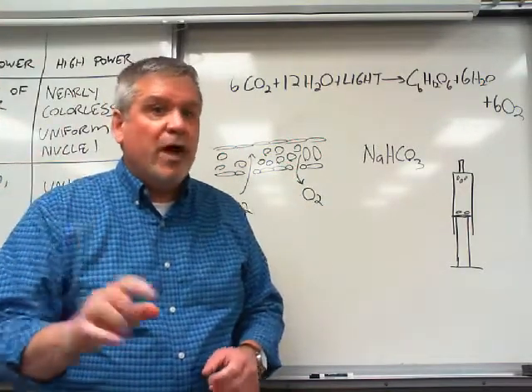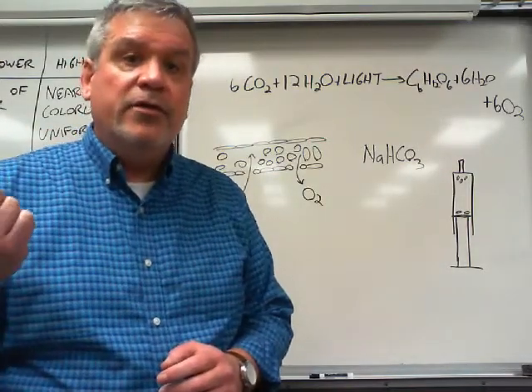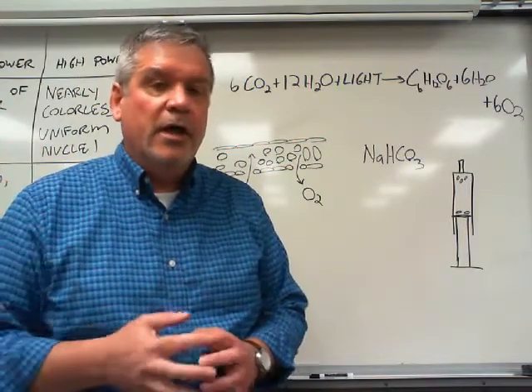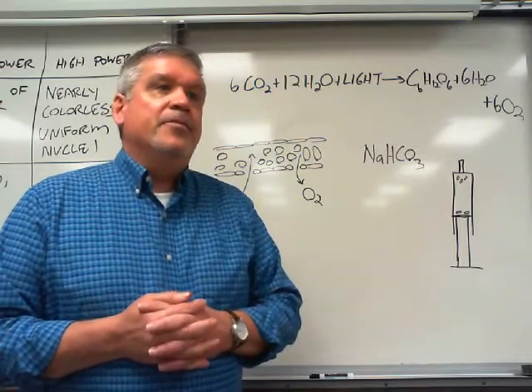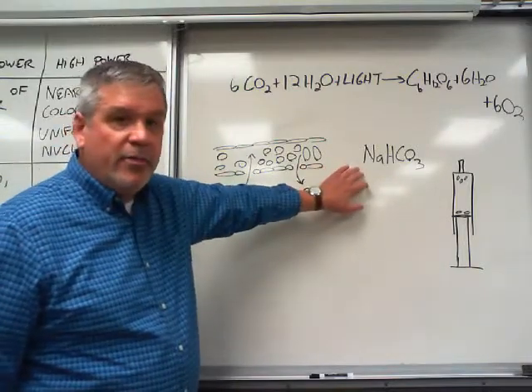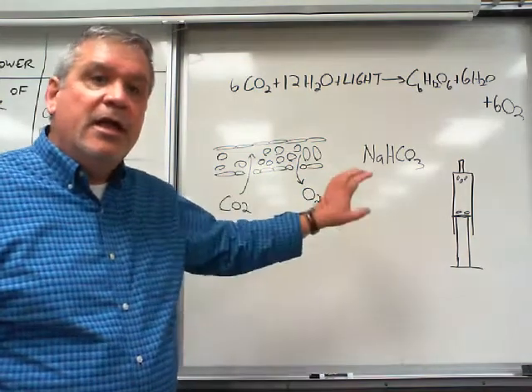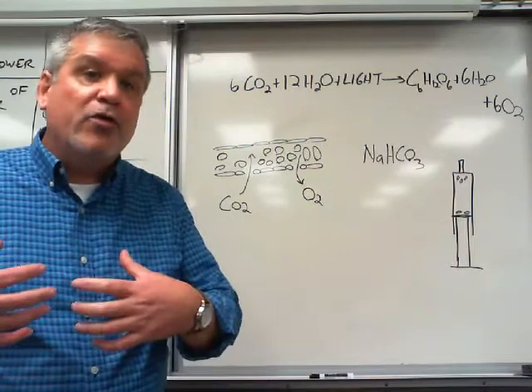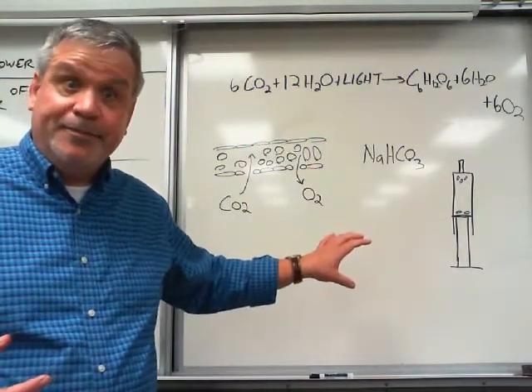Okay. One problem, once we do that, air can no longer get into these little spaces in the leaf and can't take CO2 inside the leaf where photosynthesis happens. We can get around that though. If we add sodium bicarbonate, NaHCO3, this adds a source of carbon dioxide to the water so that photosynthesis can happen.